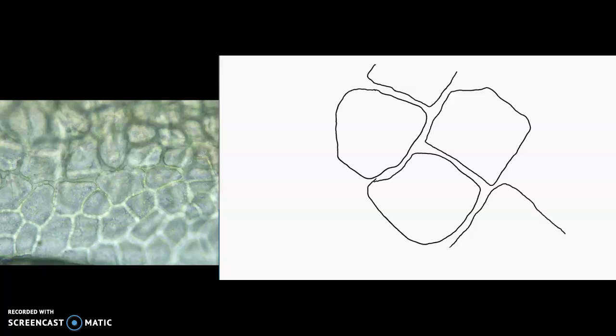The celluloses, pectin, stuff like that. But it's going to be the space between the cells. Well, it's technically not space, it's filled with stuff.